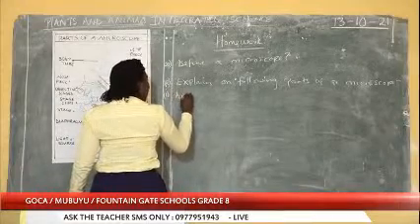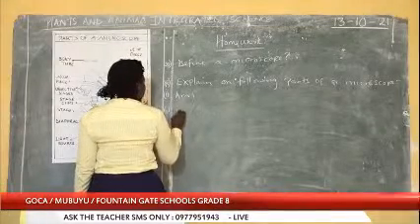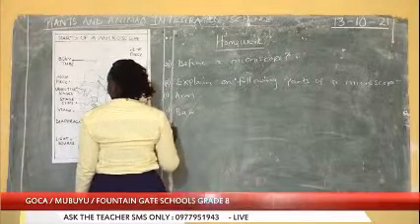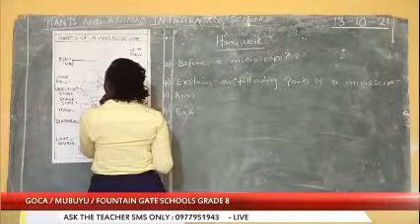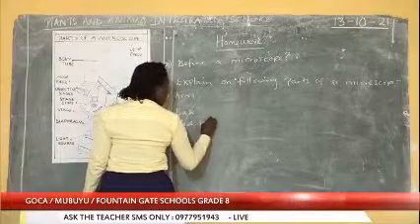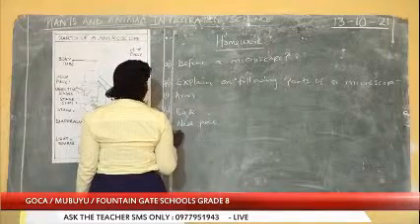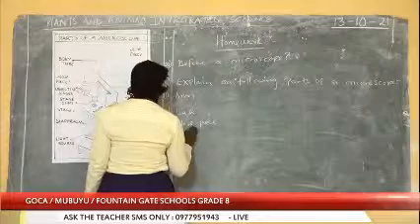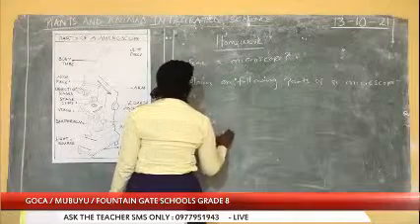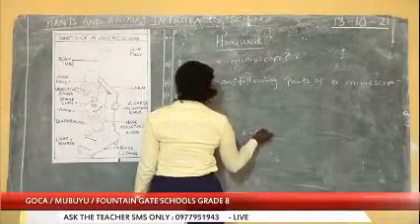The arm. What is the arm used for? 2. The base. What is the base used for? 3. The nose piece. 4. The fine adjusting knob.